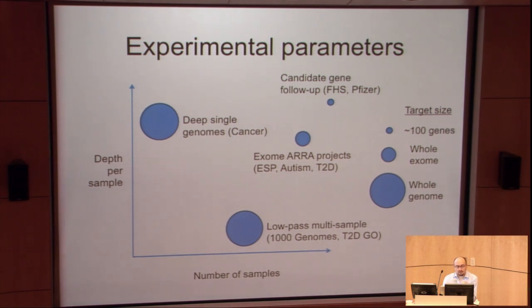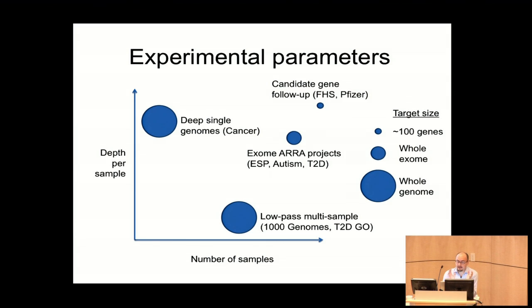I can't remember exactly the details. It varies by machine, exactly how they get the paired end. So you're bending over typically the fragment to another part of the slide and sequencing that, and that would be a different cluster that you're observing. So is there like 1,000 reads in a cluster? So a fragment? No, a cluster, well, it depends on whether you're single molecule or not. So a machine like an Illumina, there are many PCR amplicons immediately adjacent to the original fragment that compose the cluster, because you need to amplify the signal that you're viewing on the slide.